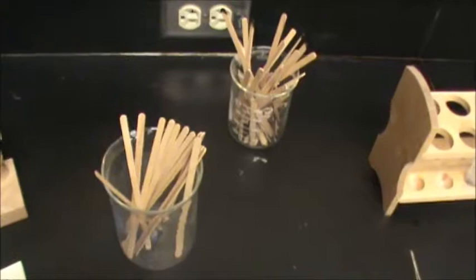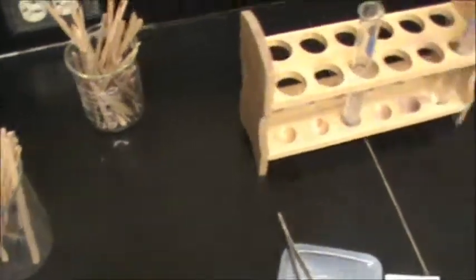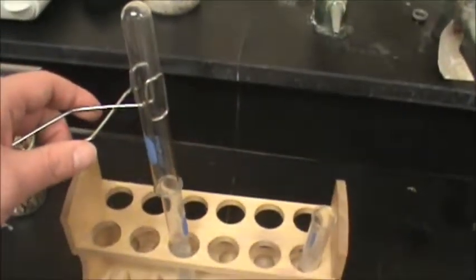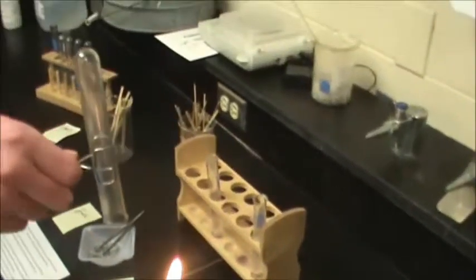So we're going to take a test tube that's sitting over here. Hopefully this will work. It's got liquid in it, of course. Do I have any dry ones? This, I guess, will work. I'm going to place it right over the opening of the test tube to invert it. We're going to collect some of the gases. So I got this gas sitting in this test tube. He's going to move it over to the open flame, and let's see what ends up happening.